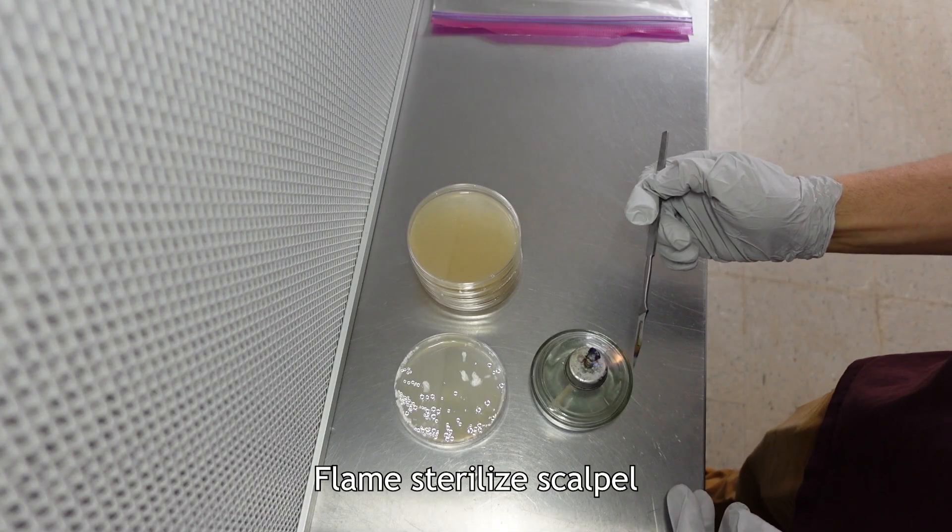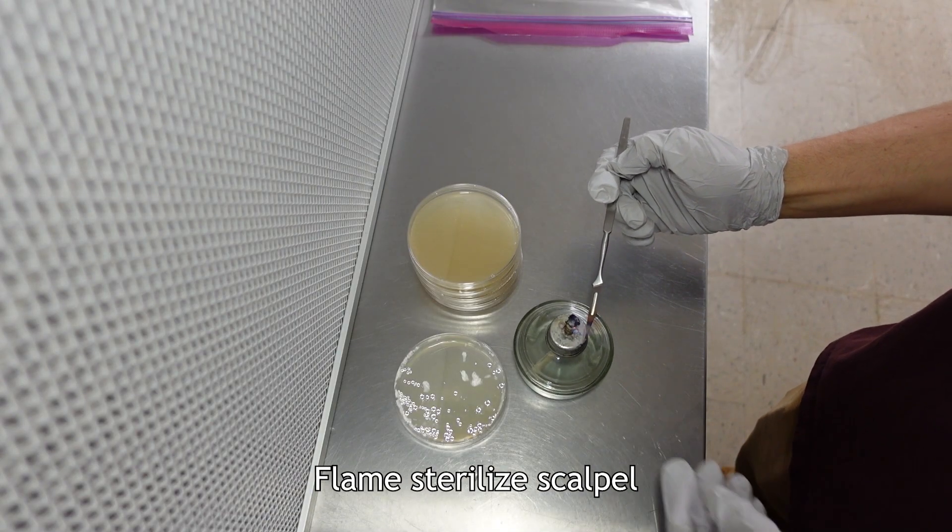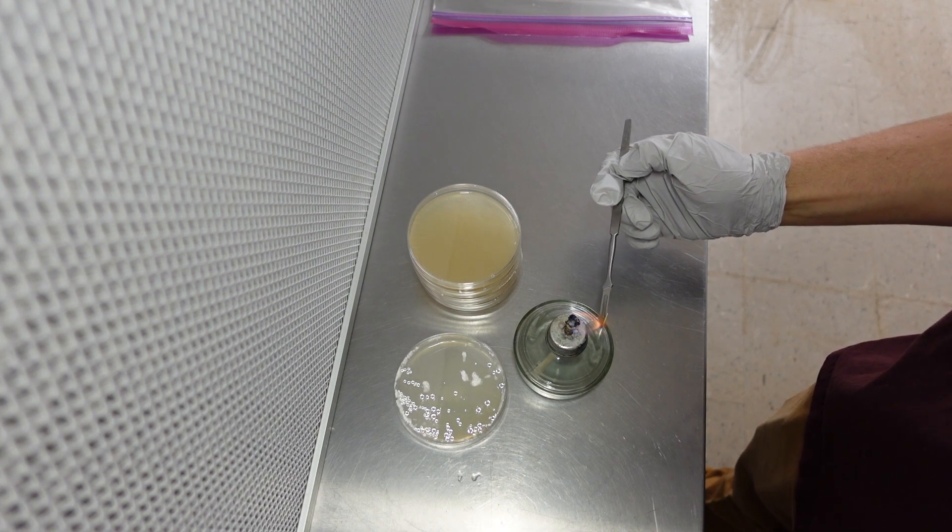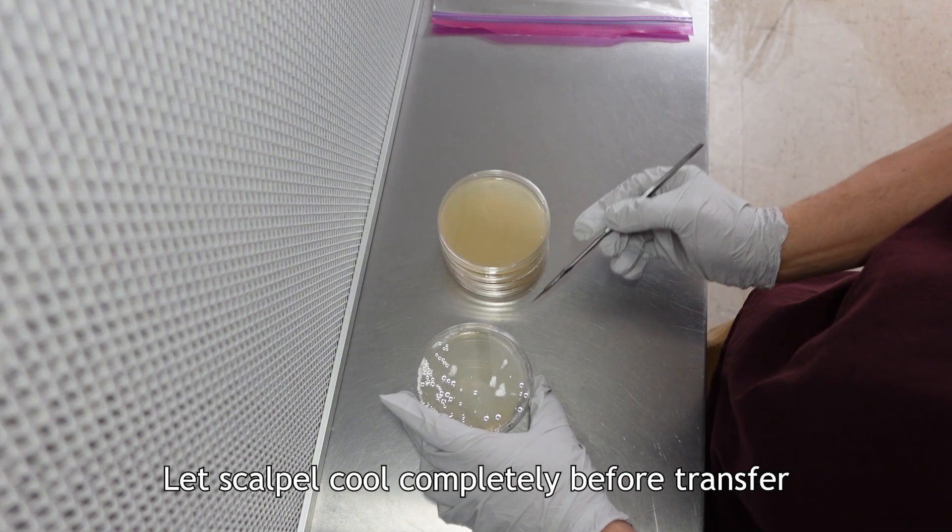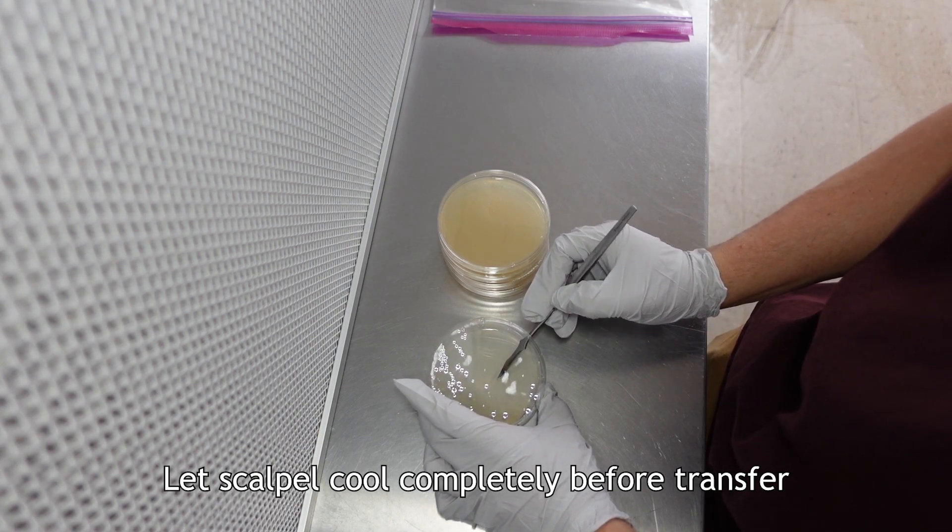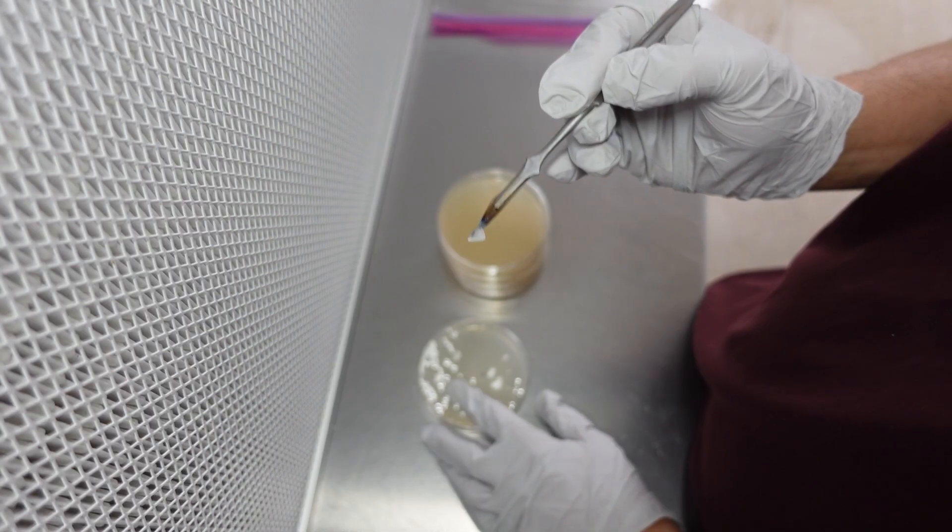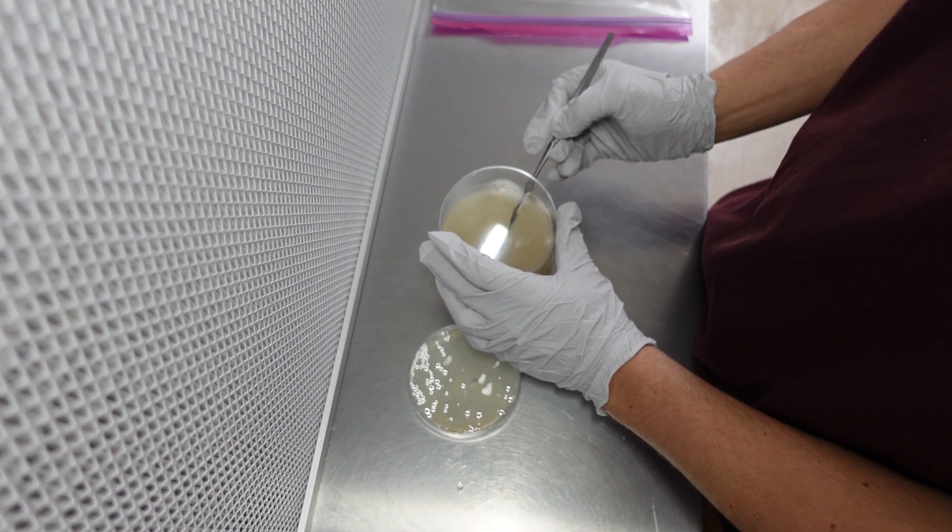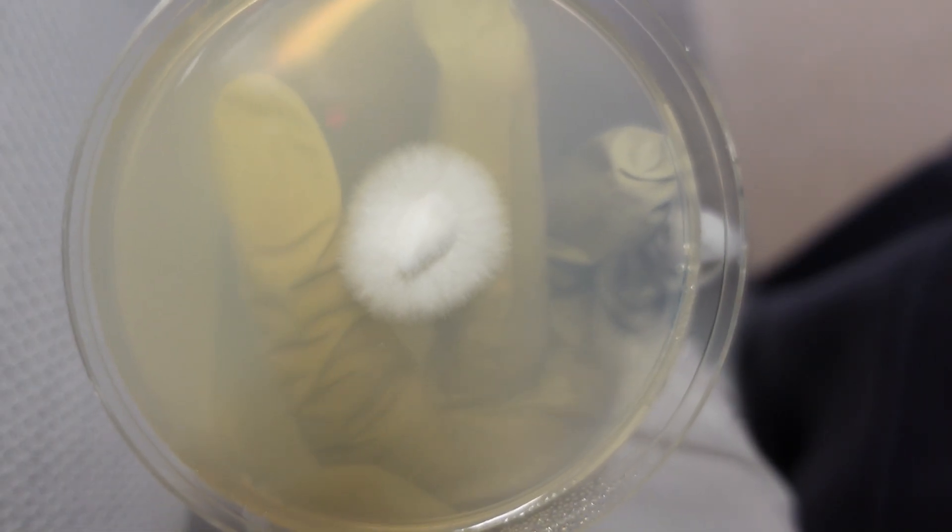To isolate and clean up the culture, flame sterilize your scalpel and cut a small piece of mycelium from the leading edge furthest away from the contaminant. Try to open the top of the plate as little as possible, just enough to fit the scalpel in. Then, quickly transfer the sample to a clean plate and seal it. Discard the contaminated plate and continue monitoring the fresh plate to ensure it is not contaminated.